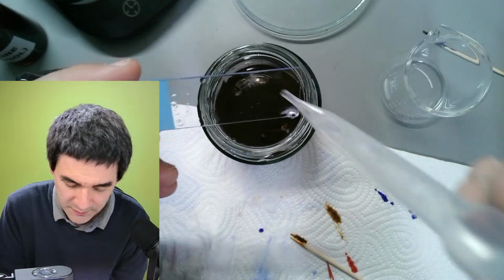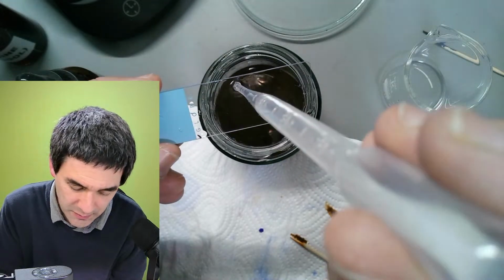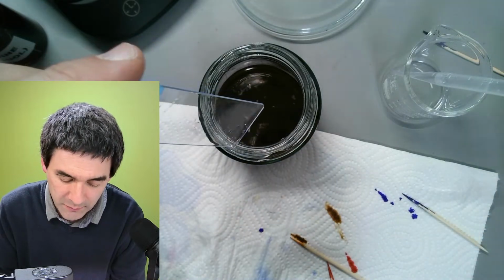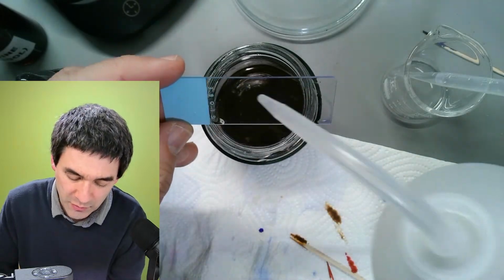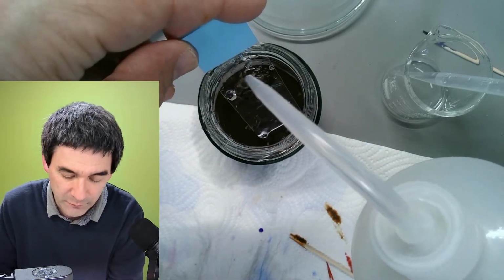I think this is going to be a separate video where I just briefly show the steps, because I can imagine that there might be some folks out there who would like to see this. So I'm going to leave it like this. I'm going to quickly rinse again with water. I should have held it differently.